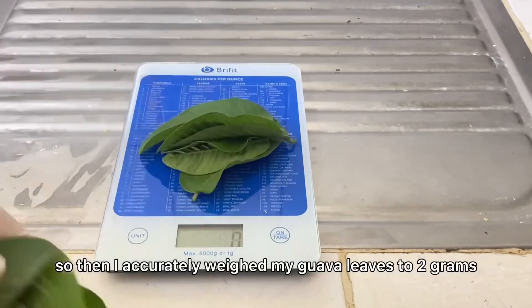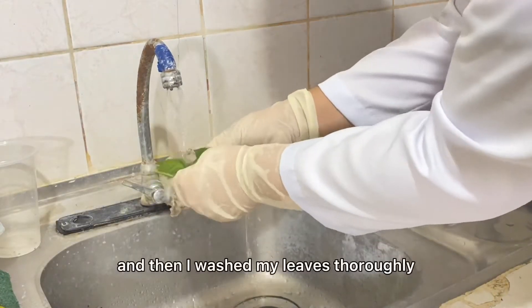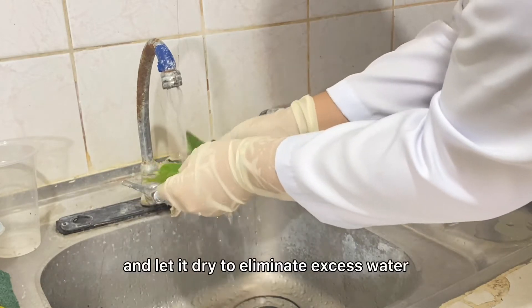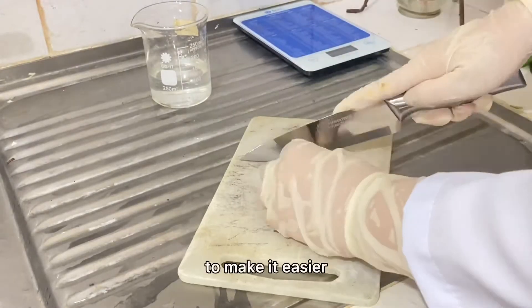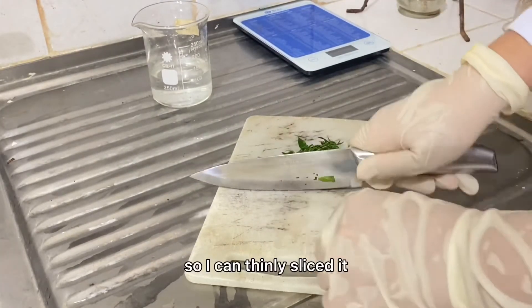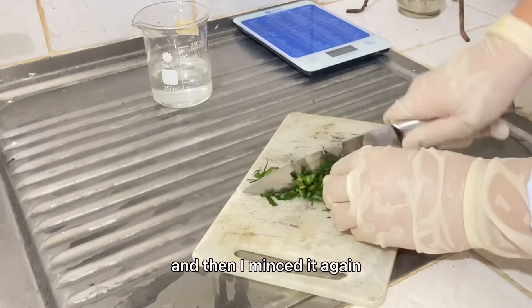I accurately weighed my guava leaves to 2 grams, then washed my leaves thoroughly and let them dry to eliminate excess water. To make it easier, I folded my leaves so I can thinly slice them, and then minced them again.